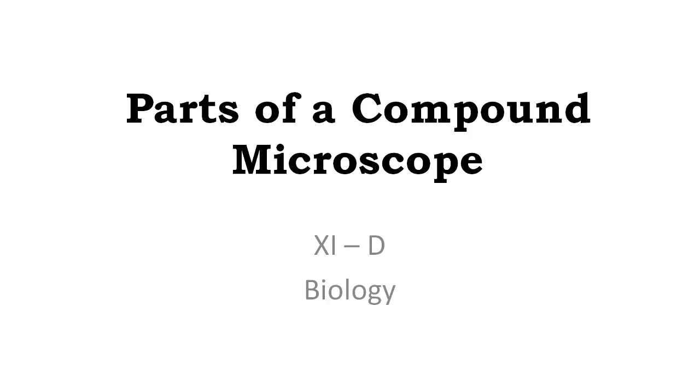Our naked eyes cannot see very tiny objects like viruses, bacteria, or even our cells, plant cells or animal cells. So in order to observe and study them, we use an equipment called a microscope. There are different types of microscopes, but in our practicals we are going to study one type called the compound microscope. It's a light microscope.